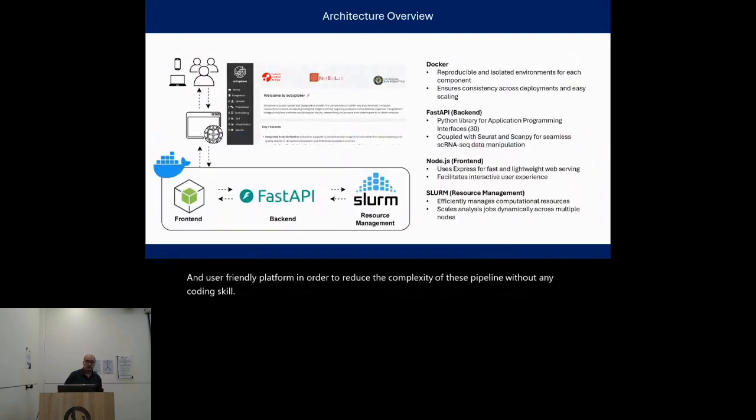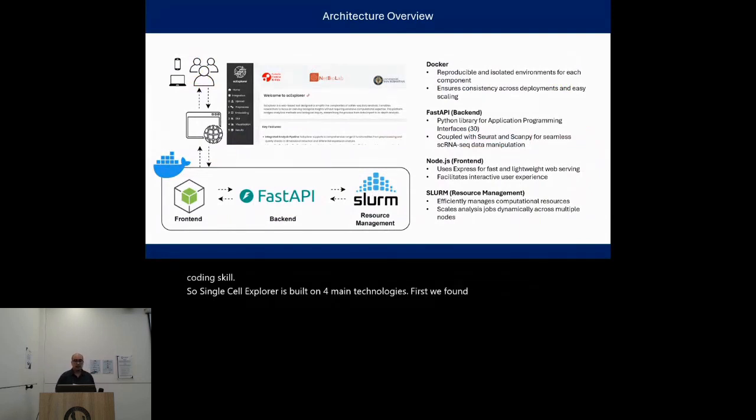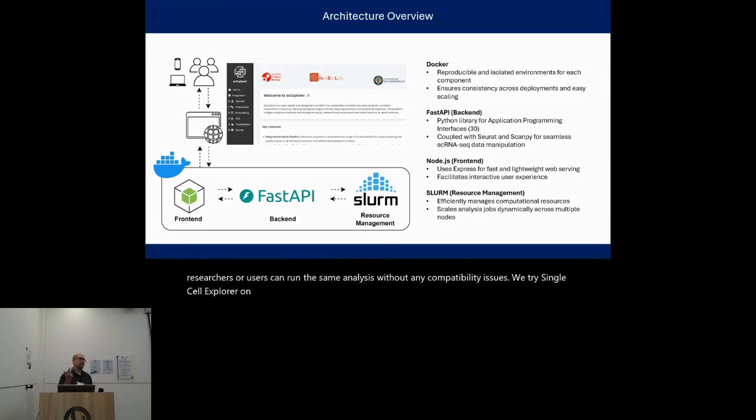Single-Cell Explorer is built on 4 main technologies. First, we find Docker, which helps us to reproduce and isolate the environment of each one of these components. That means that researchers or users can run the same analysis without any compatibility issues. We tried Single-Cell Explorer on macOS, Windows, and Linux, and we obtained the same results.